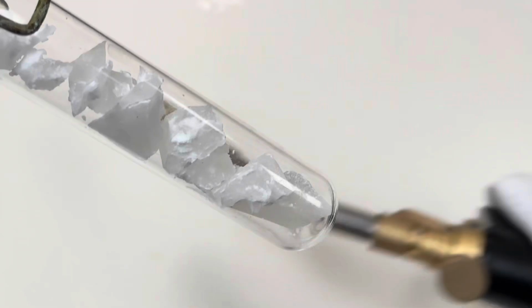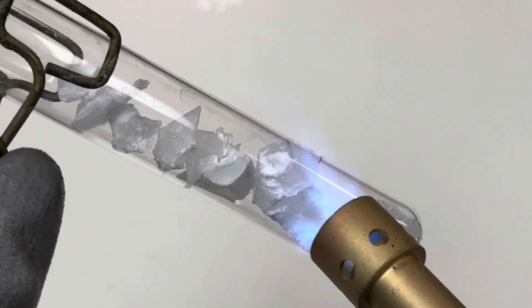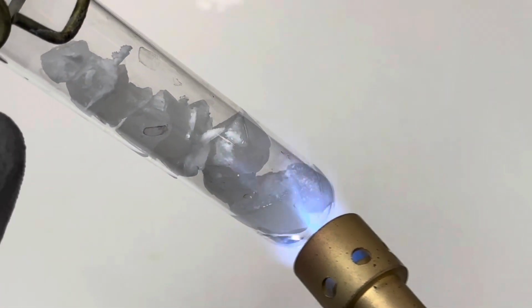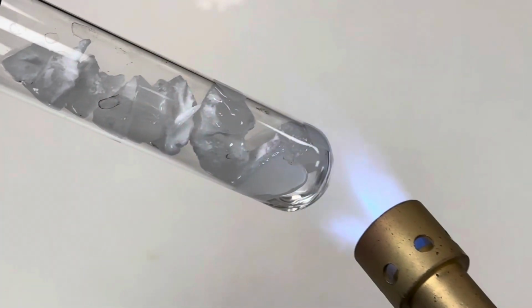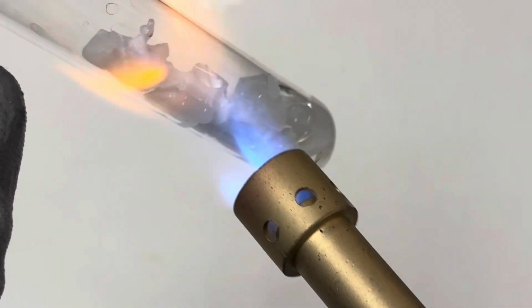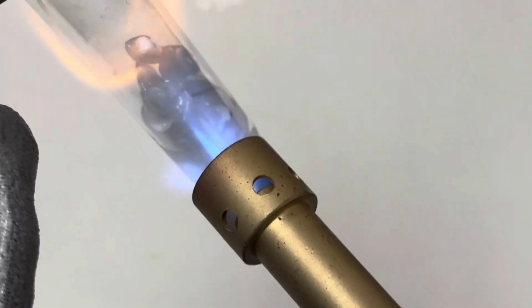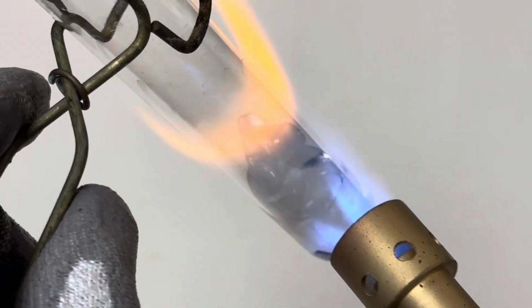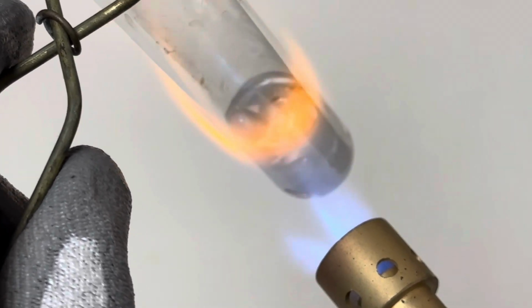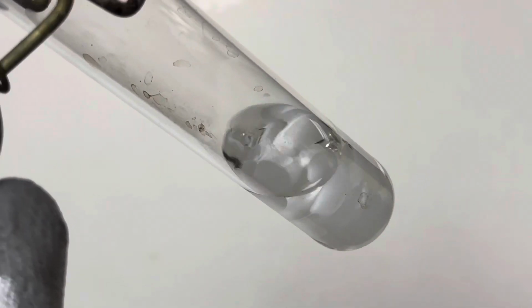Now with your blowtorch, start melting the wax. Be careful that you don't bring the wax to a boil.